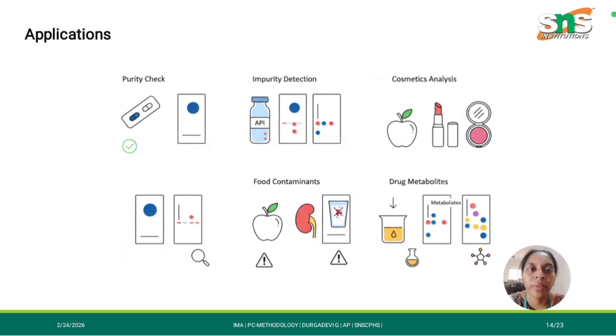The applications are purity check, impurity detection, cosmetic analysis, food contaminants, and drug metabolites.